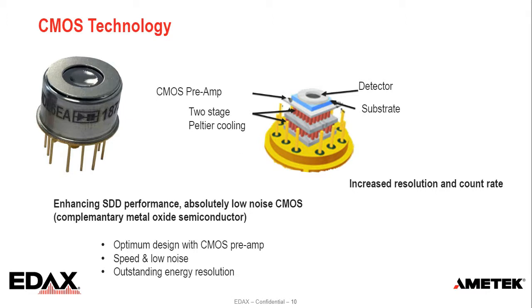Here we can see the single elements of the electronics with the SDD, CMOS preamplifier, and the two-stage Peltier cooling. The sequence and the ideal design of the electronic increase the count rate within the energy resolution and enable low noise and fast analysis of data.